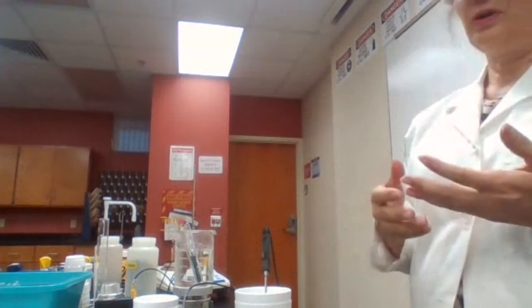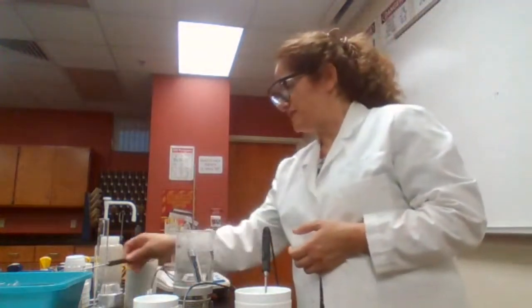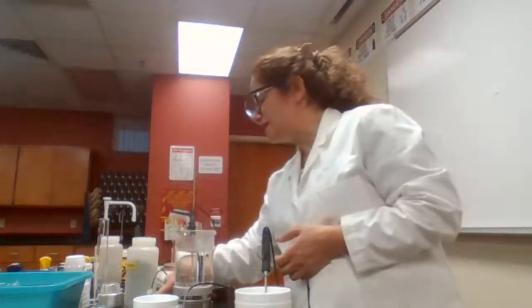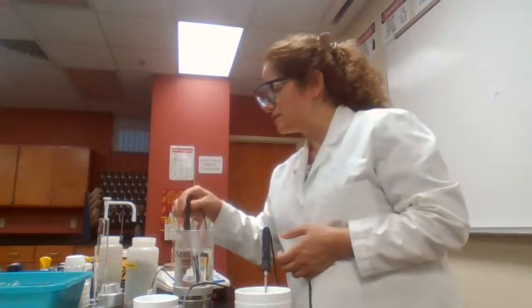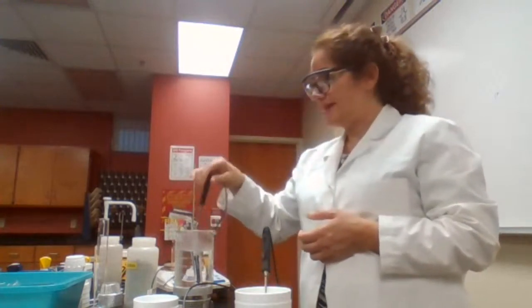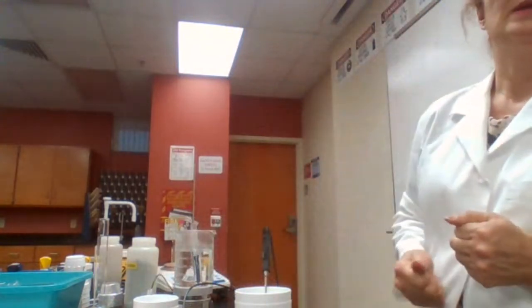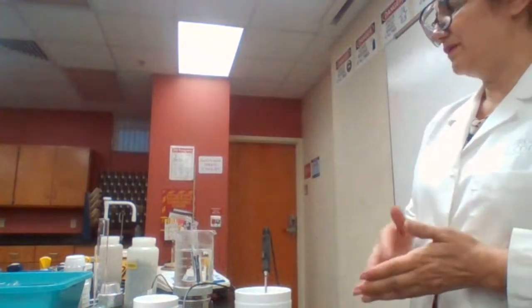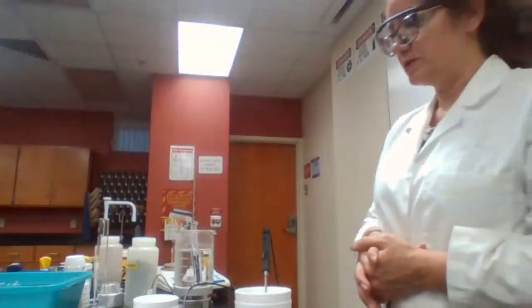But to make sure, we can always measure that number. And if it's not 100, we can change that number. But I don't want to confuse you guys. Even though, no, it's good. It is 100. So that 100 is basically the initial temperature for the metal. And then the maximum temperature when you mix it is going to be the final temperature for both the metal and the water.